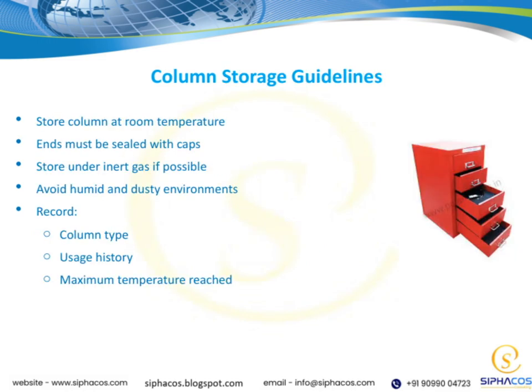Now, let's look at some essential guidelines for storing columns properly. First, it's best to keep the columns at room temperature. This helps maintain their stability and prevents any temperature-related degradation. Next, it's important to seal the ends with caps. This simple step prevents contamination and keeps the column's interior protected.